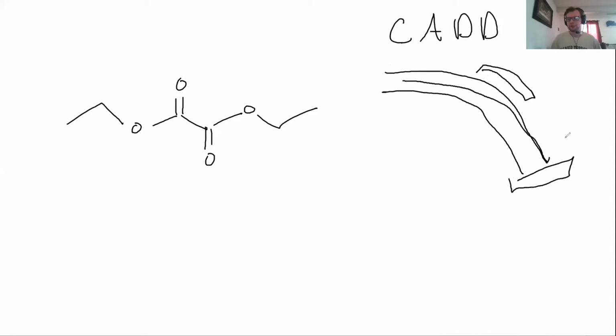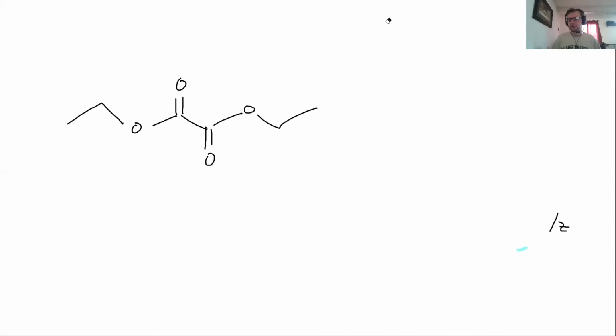So the heavy molecules go towards the top. They don't get deflected as much. So it's kind of like if you're trying to push a cement truck, is the example I've read. It's much harder to push, so that's why it will end up here. That's why we see the 146, the whole molecule. It's a lot heavier. Now the little tiny carbon anion, or whatever, that weighs 13, mass to charge ratio. That's like pushing a Honda Civic or maybe a bicycle. So it's way easier to deflect. So that's why we get our difference. So that's kind of a little refresher on the mass spec.